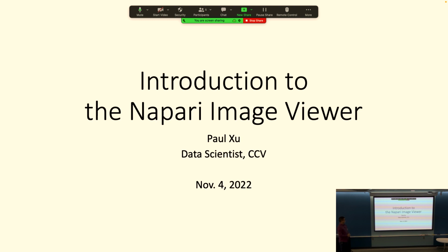So you might be asking why you're excited about an image viewer. Even my browser can do image viewing, right? But Napari is much more than just an image viewer. First, it specializes in high-dimensional images.